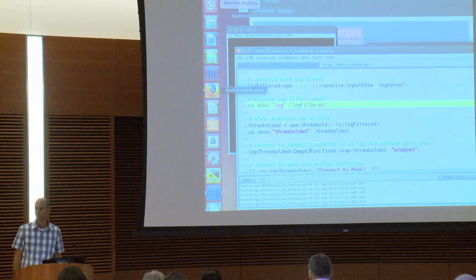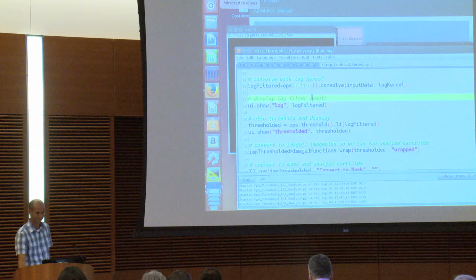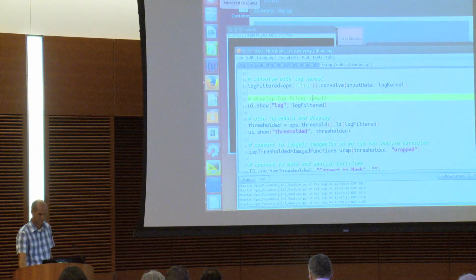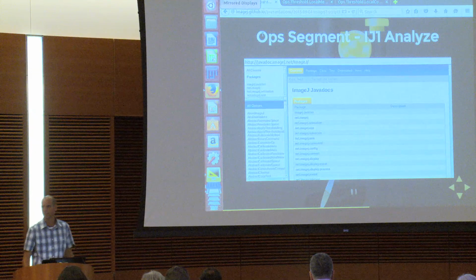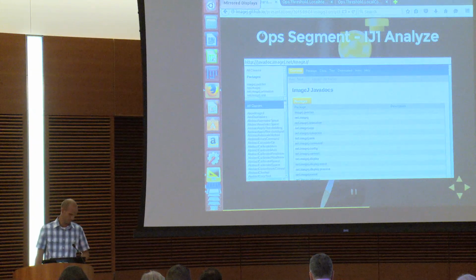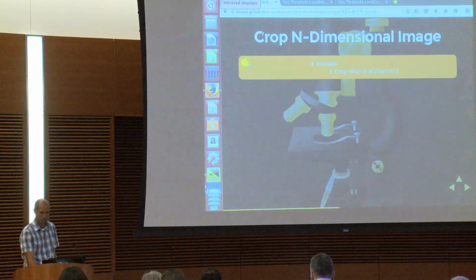So doing that will be easy, in quotes. Might work already, but we have no examples. We'll get to a script that shows that in code, like having an op that uses another op internally. It's quite nice. Okay, thanks.